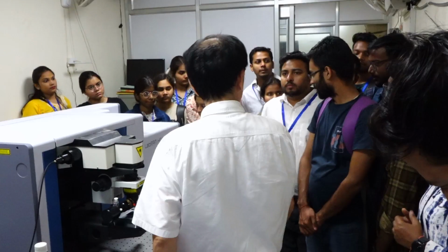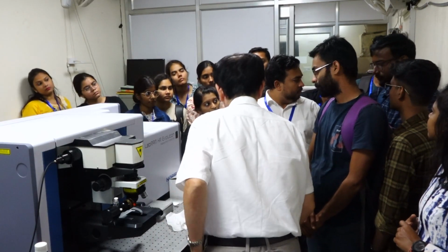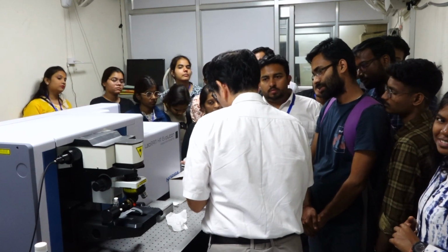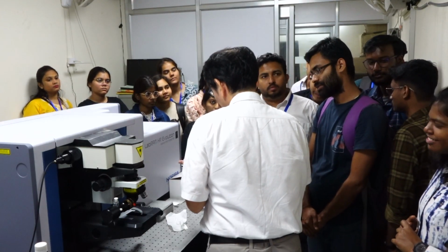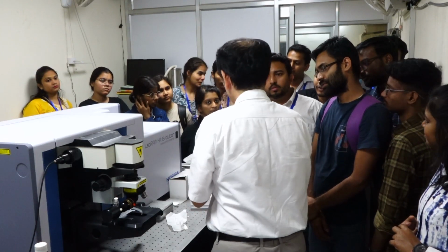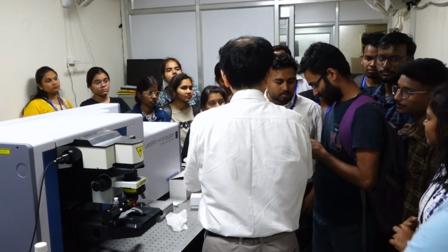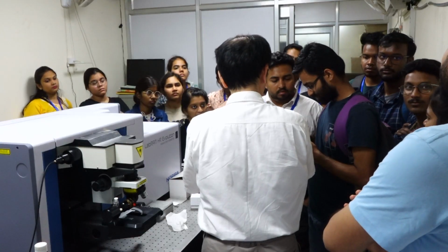Any other question? SERS is used to study fingerprints. Then we have to set up the baseline to detect it. SERS is not a generalized term, so it's not used everywhere.